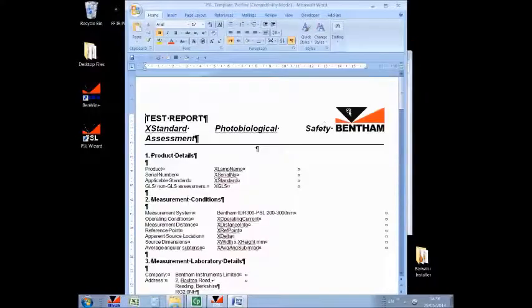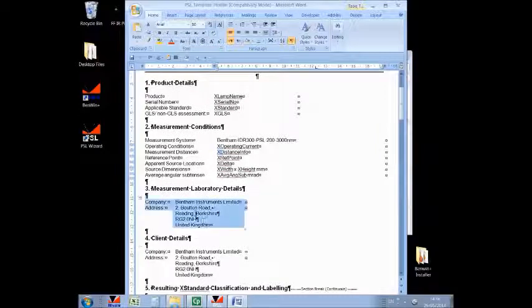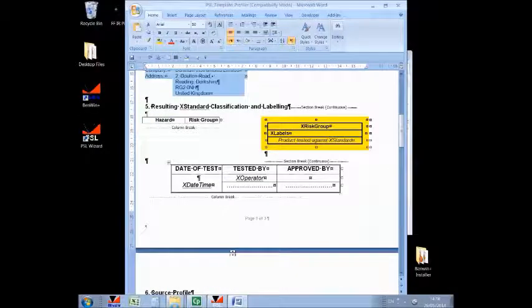And we can see that the logo can be changed and some of the naming could be potentially changed, but the software is using a search function on these parameters, which must therefore not be changed. The laboratory details, etc., can be changed equally.